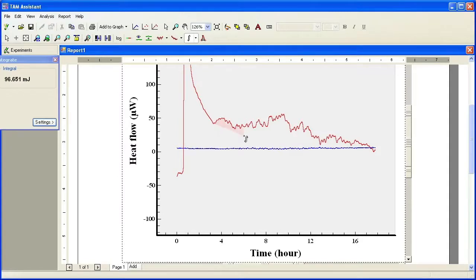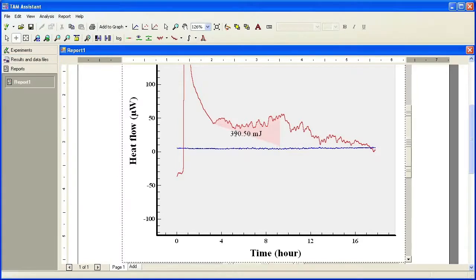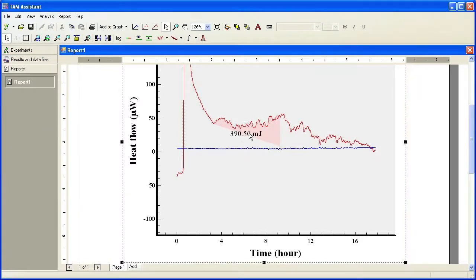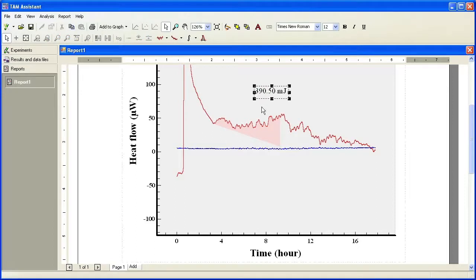So I'm just going to integrate under the plot here. This is not correct but only for visualization example. So now we have a text box of that integration.